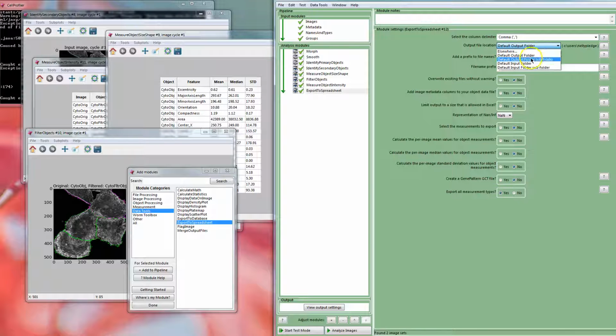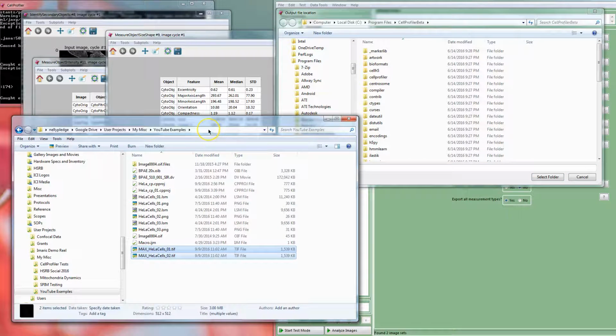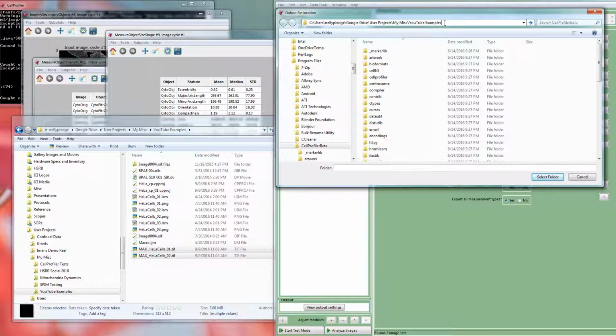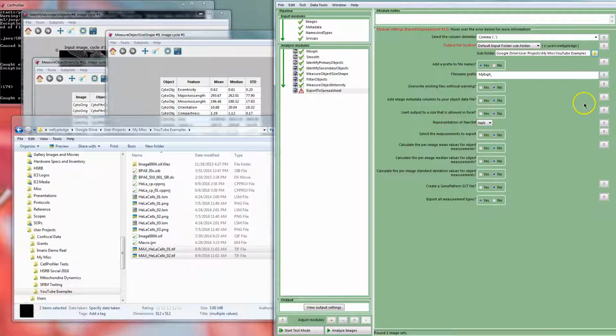You've got these default output and input folders, which you can define down here, and if it's just your machine all the time, then that's fine, but I often just use it elsewhere and I tell it where I'm going to go. So let me copy the folder in from here, and then we can just go straight in there and do it that way. And you can go through and read all the options here about the export.